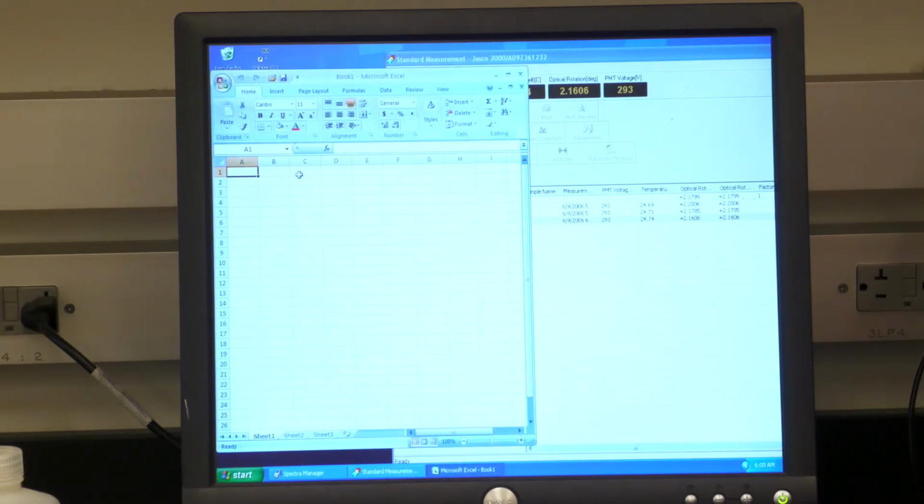So now, for example, this is Excel. So let's say this is 1, 0, 1, 2, 3, etc. Right? So that is your 0 minute, 1 minute, 2 minutes, 3 minutes. You can highlight, then go to this edge, get the cross, then drag it. It will automatically fill this one for you. Okay, then you will input your data here. Your first one is 2.2006.